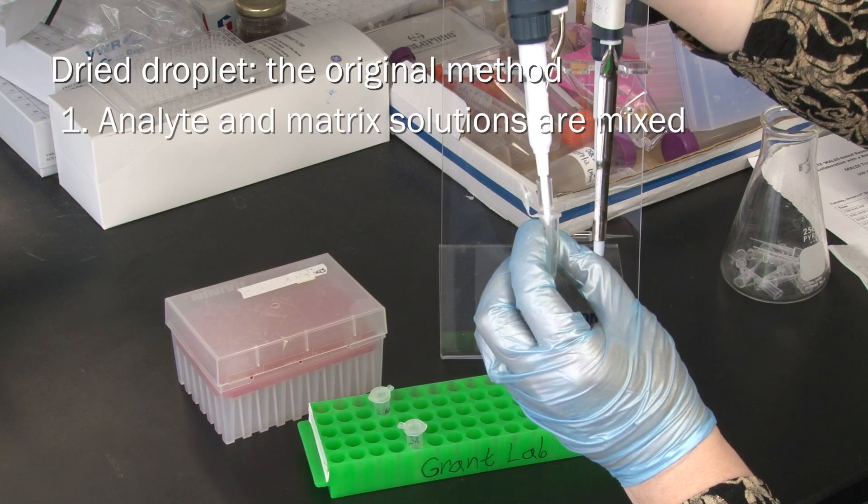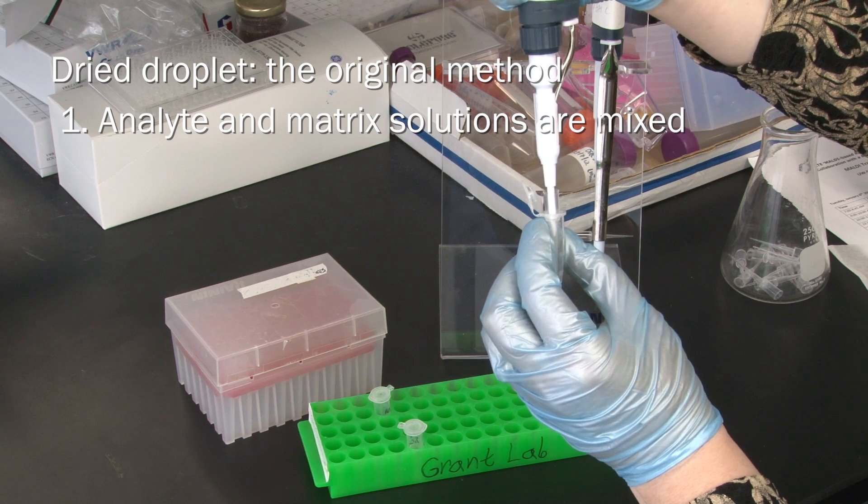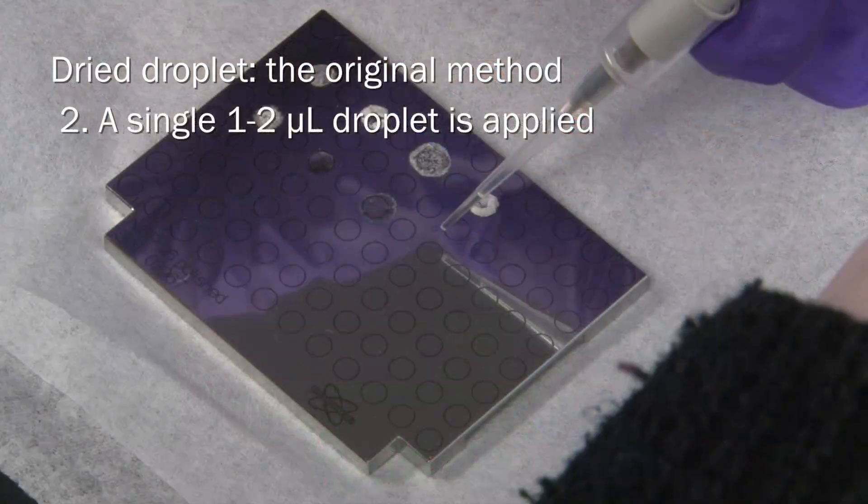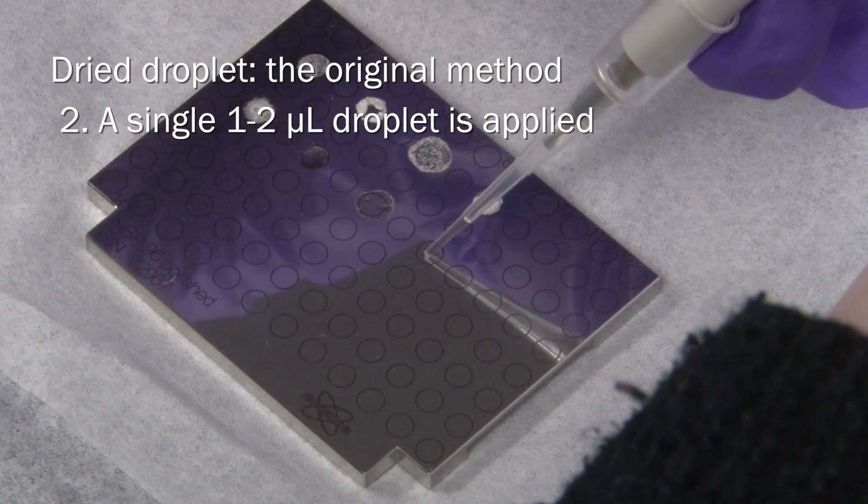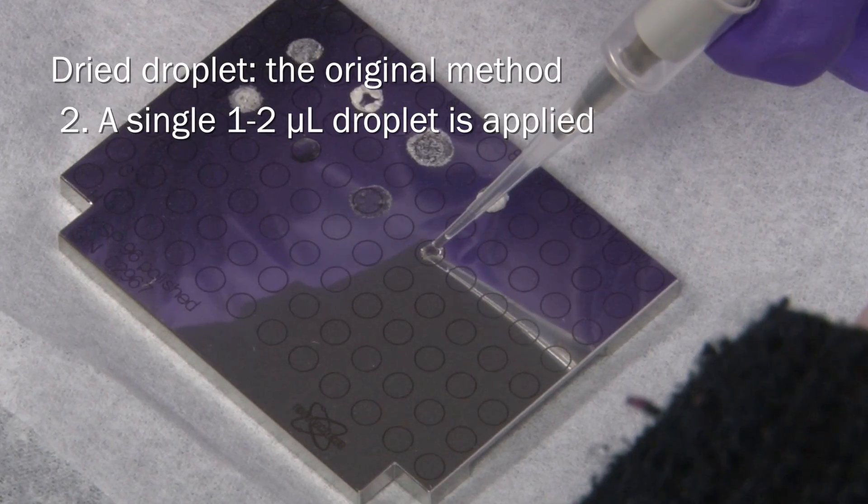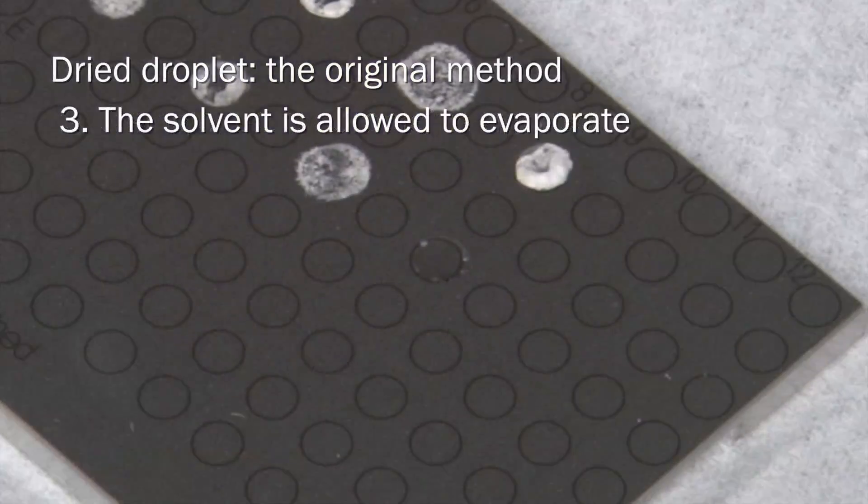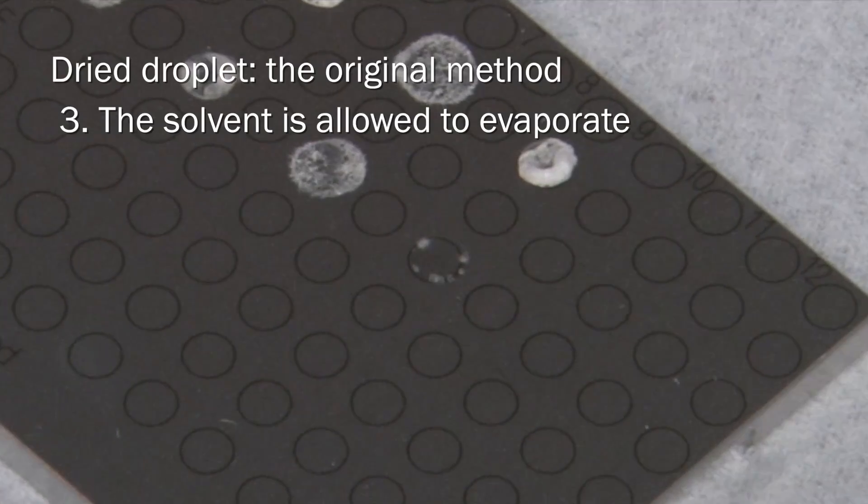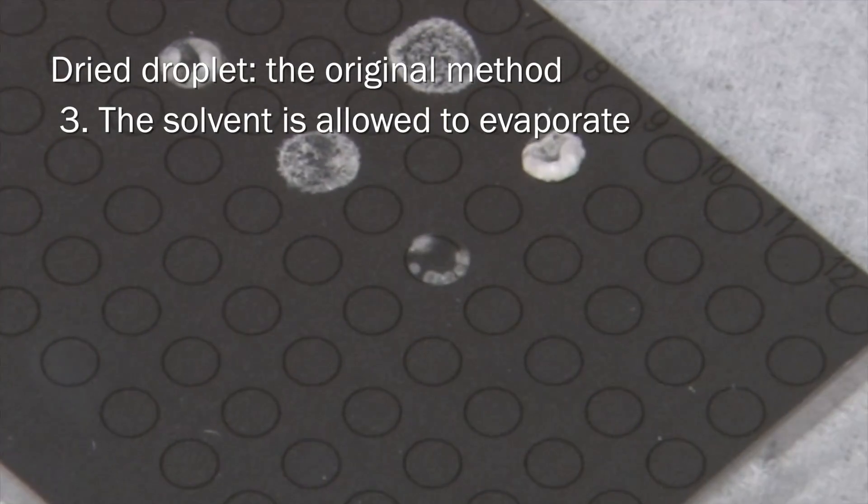In this technique, the analyte and matrix solutions are first mixed in a ratio of your choice, and then a single 1 to 2 µL droplet is applied to the target with an Eppendorf pipette. The solvent is allowed to evaporate while the matrix and analyte co-crystallize.